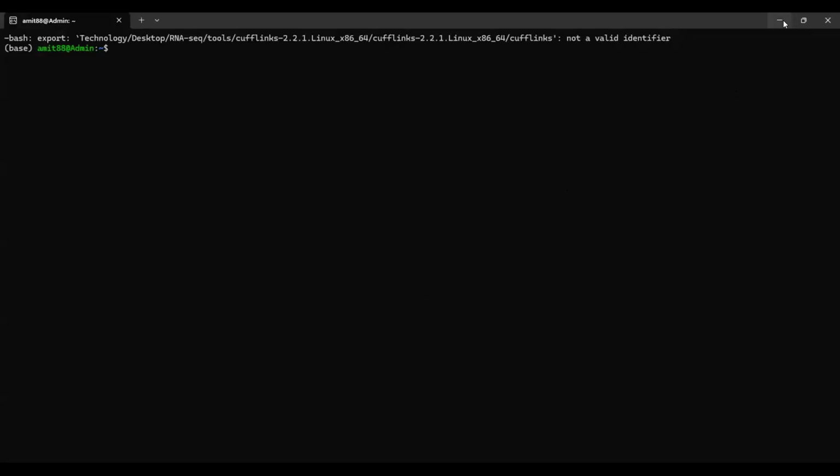Okay, nice, Shubham. Cancel this. Just open the Ubuntu.